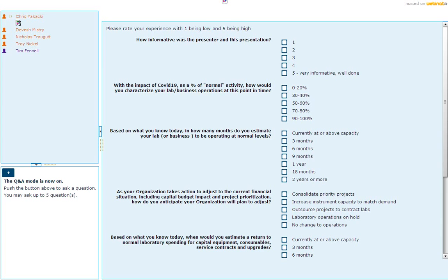The ElectroForce is real nice because you can obviously go as slow as you want, right? I know our slowest rate was 0.2% per second. We could have made that much slower. My students sometimes will yell at me if I ask for that, but we could go slower. And we then got strain rates on the high end around, I'll just say, 220% per second, if I remember that right. If you looked at the displacement rate of the crosshead, it's usually around a half a meter per second, give or take. The ElectroForce moves about as quick as it can move, which is still really fast.